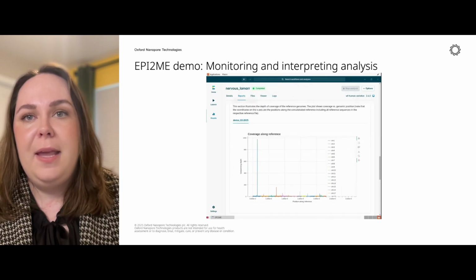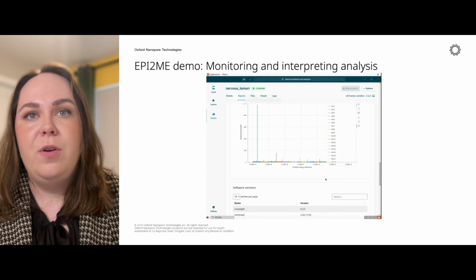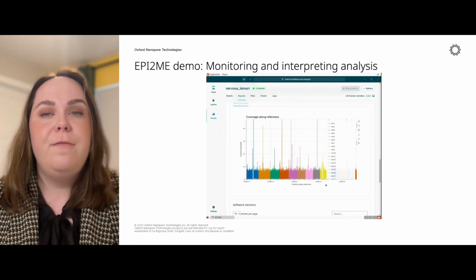Genome-wide library mapping is also interactive. You can navigate to different chromosomes and zoom in to see their coverage across each chromosome, delineated by color. So in this case, I'm going to zoom in. So we can see the chromosome coverage is less than 10 as I intended for the subset data.